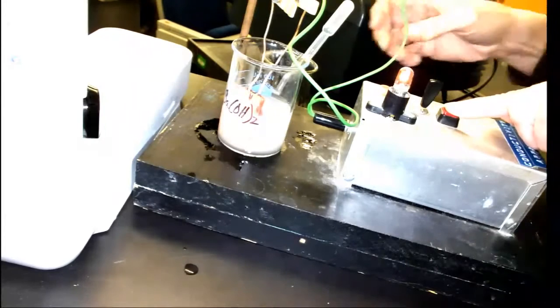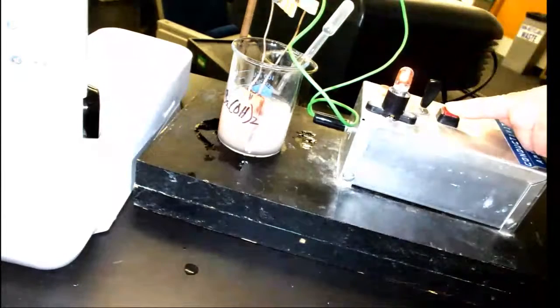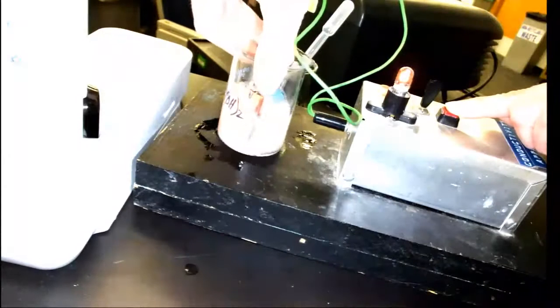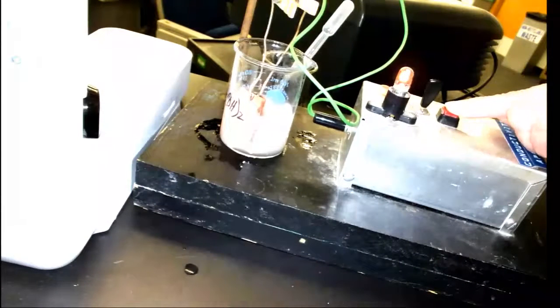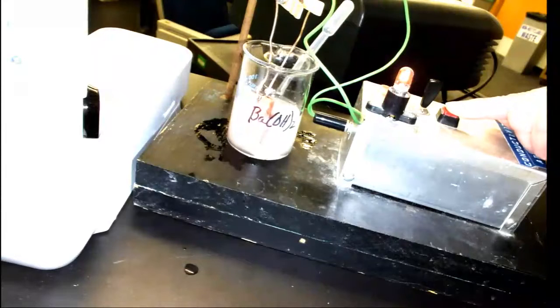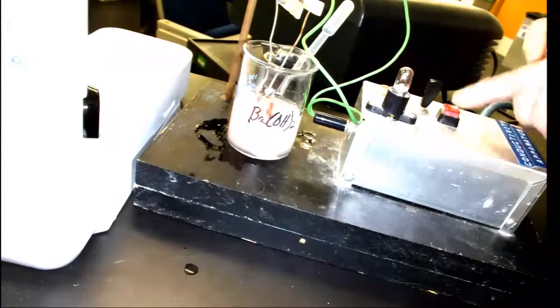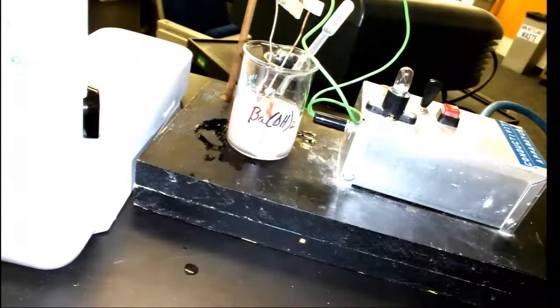The light bulb begins to glow. So notice also the color of the solution in the barium hydroxide beaker. Now it's combined with the sulfuric acid. It's very murky looking. That's the precipitate of barium sulfate formed from the reaction of the sulfuric acid and barium hydroxide. All right, that's what I wanted you to see. It's a nice way of thinking about acid-base neutralization and how the conductivity apparatus demonstrates the presence of electrolytes and ions in solution. I hope you find that helpful.